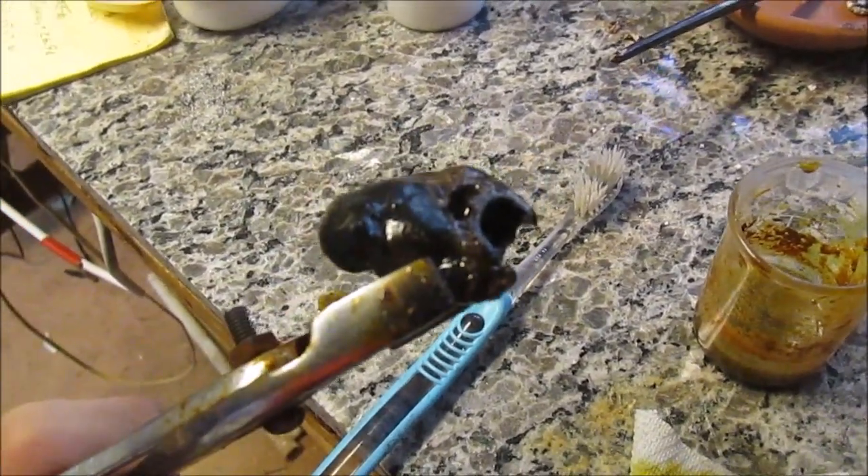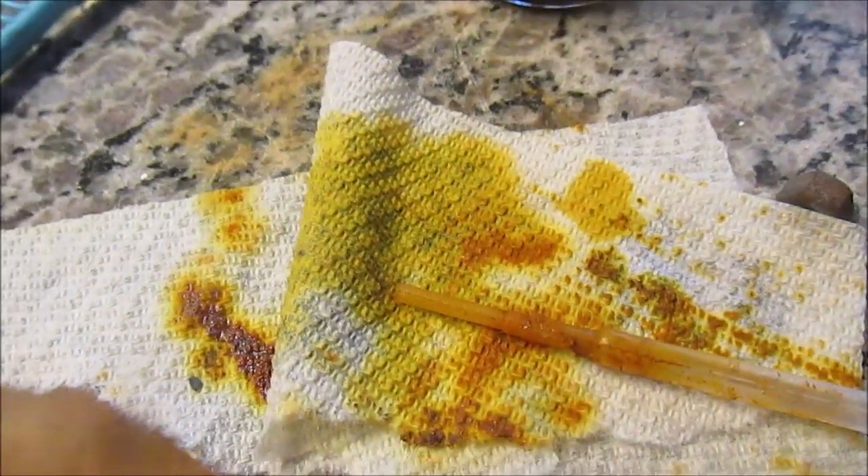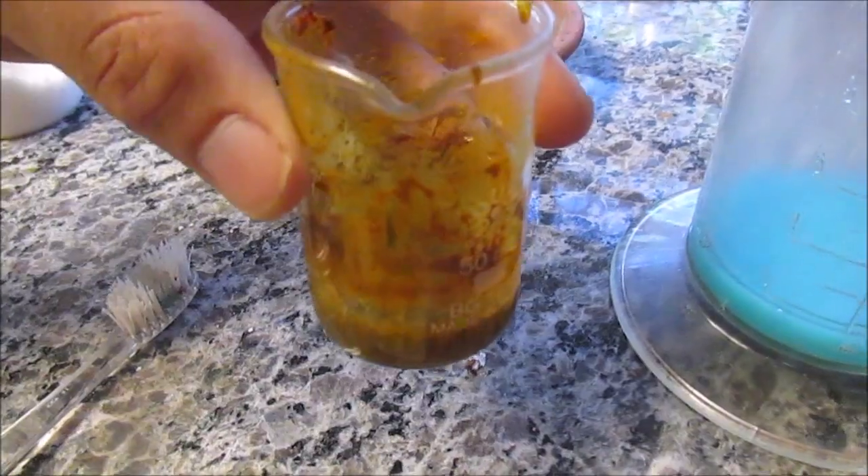The first step to converting iron slag back to thermite was to dissolve the iron we had recovered from the first thermite. This was easily done with concentrated hydrochloric acid — in our case, 32% from pool cleaner. With our old iron redissolved, we could more easily affect it chemically. To get it from a chloride to an oxide, however, we had to increase its ionic charge first.